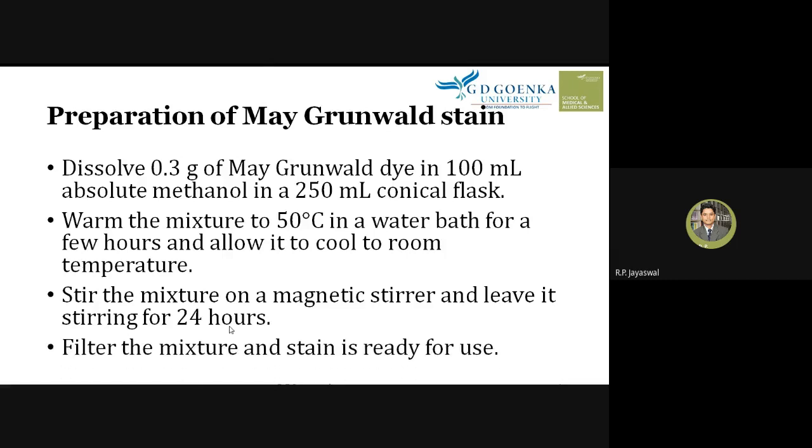And after that, we need to do the filtration process. We have to filter the mixture, and then the filtrate is now ready for use. So this is the instruction we have learned, that is, how to prepare May Grunwald stain.